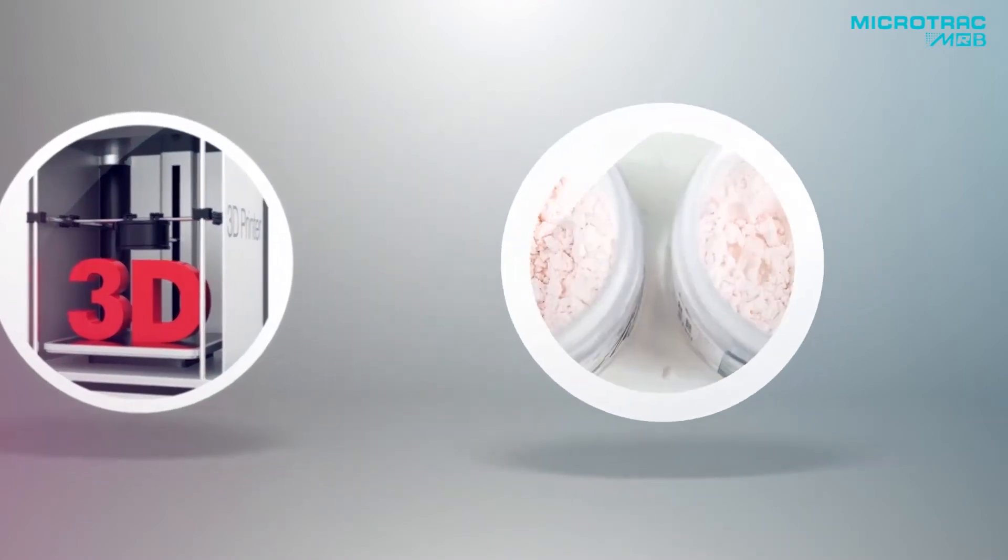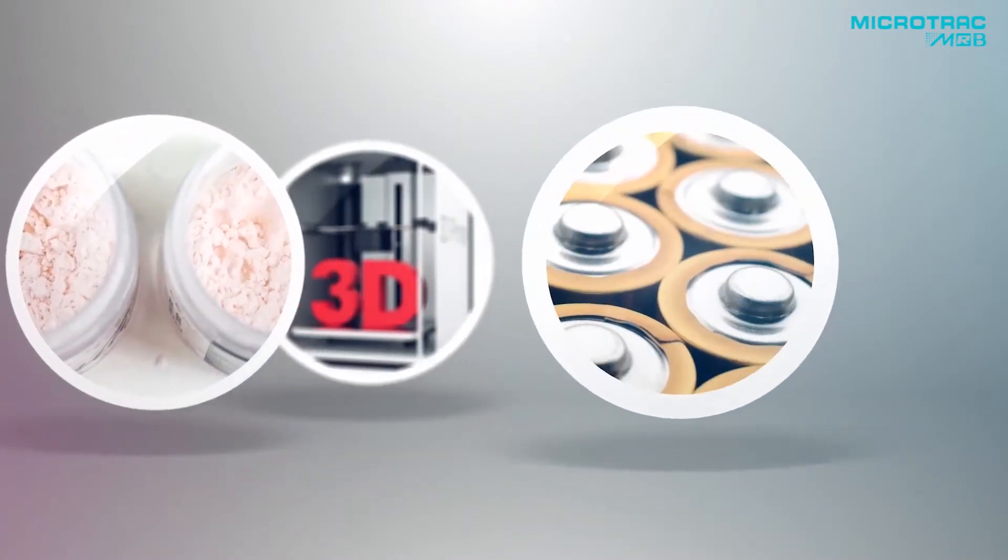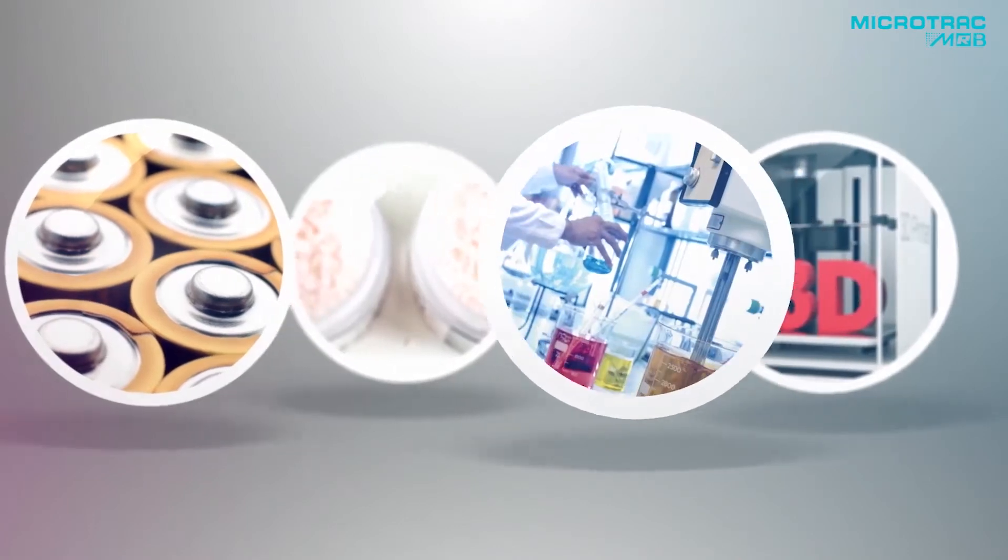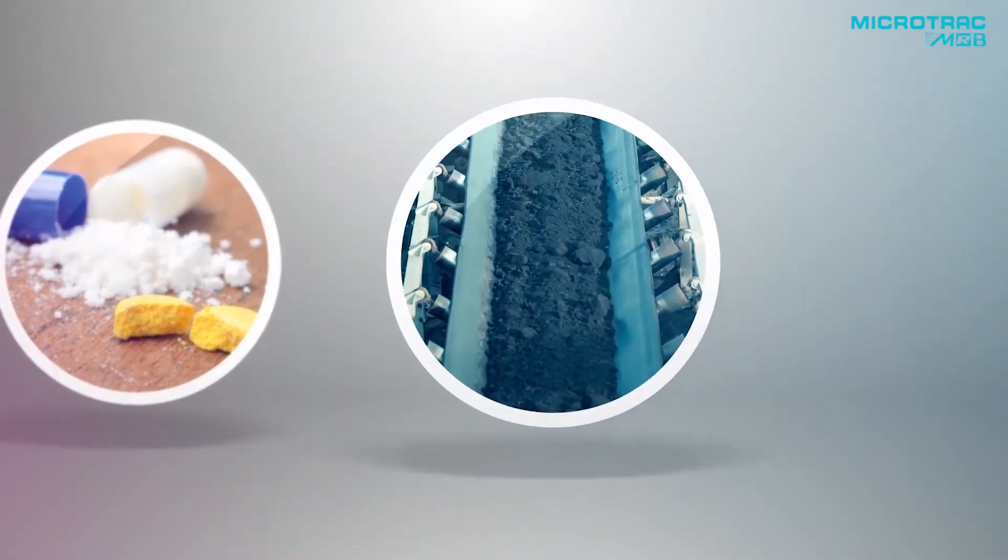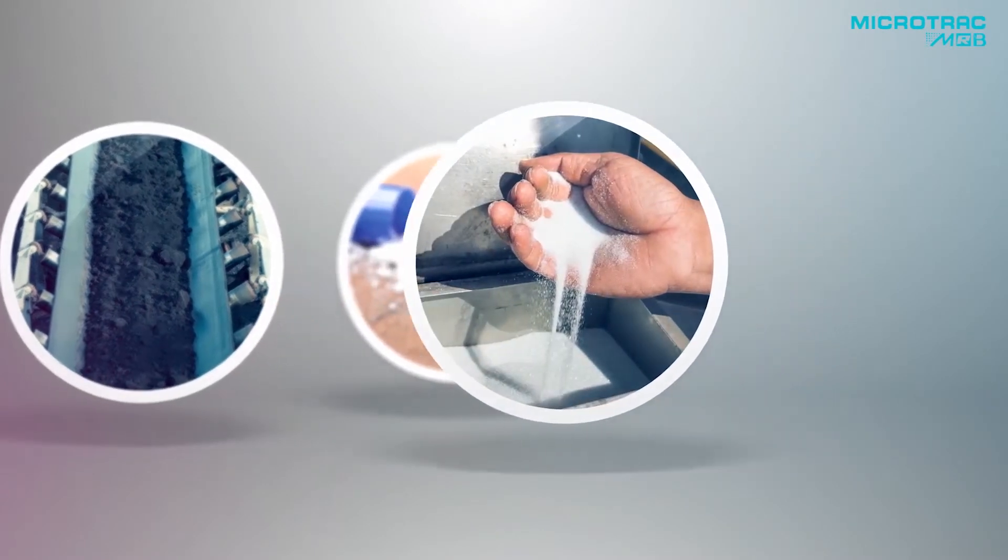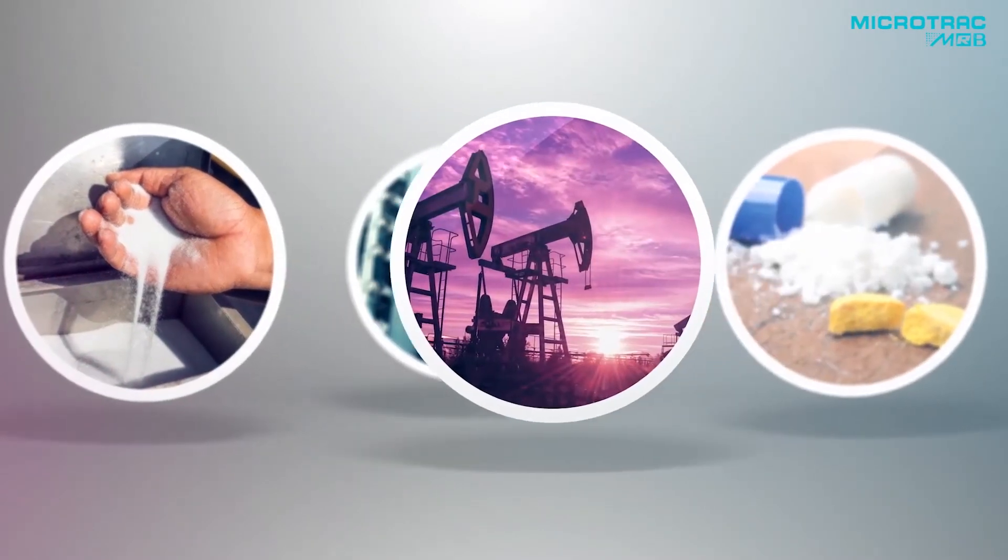The Sync is the perfect system for a wide range of wet and dry applications, including metal powders, ceramics, batteries, chemicals, pharmaceuticals, cement, industrial minerals, glass beads, propens, paints, coatings, toner, and additives, among many others.